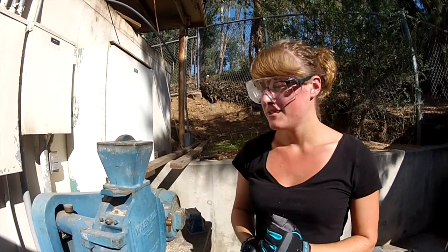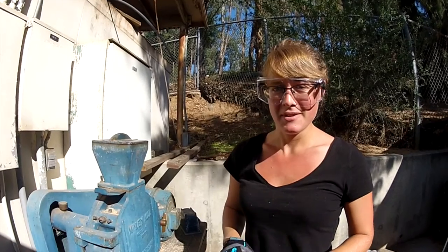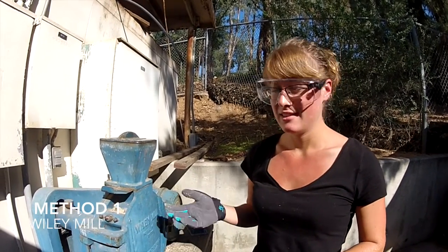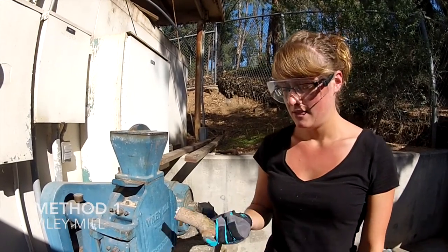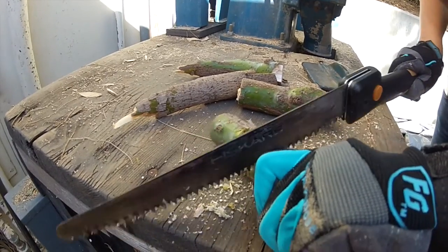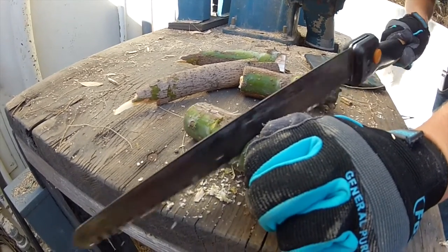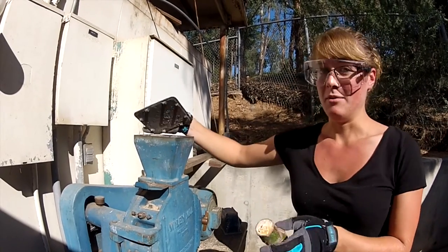There are two methods that we use to make the sawdust for the Polyphagous shot hole borer rearing diet. The first is to use a Wiley mill, like this one. To do this, the avocado log needs to be cut into small chunks that are less than 10 centimeters long, so that they can be fed into the machine without it jamming.